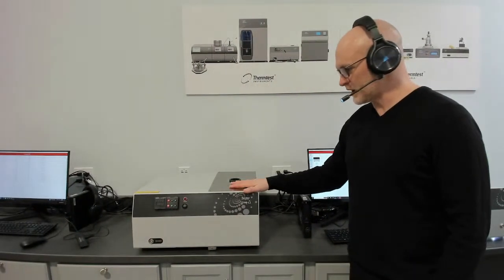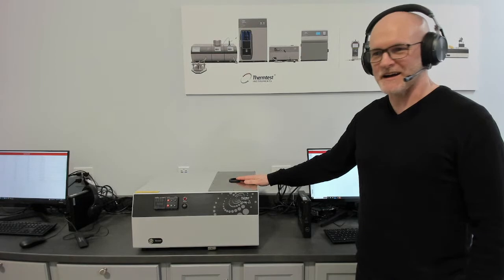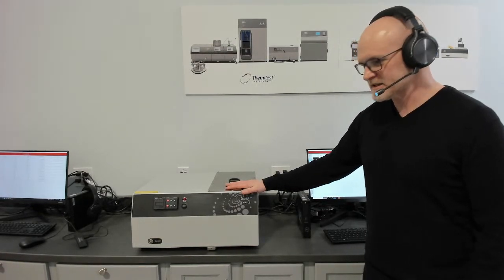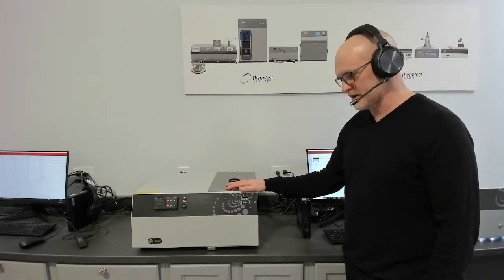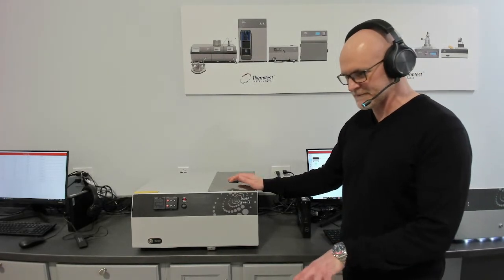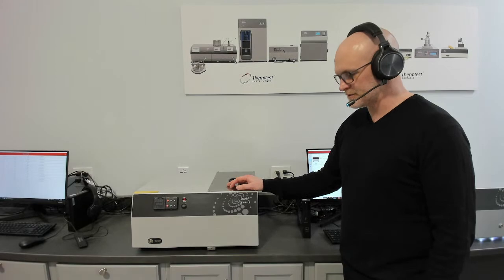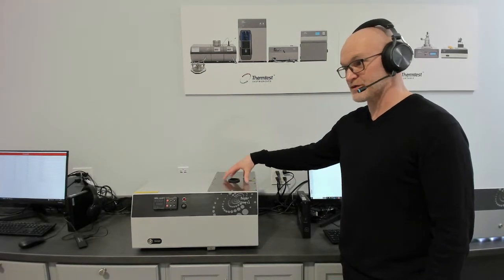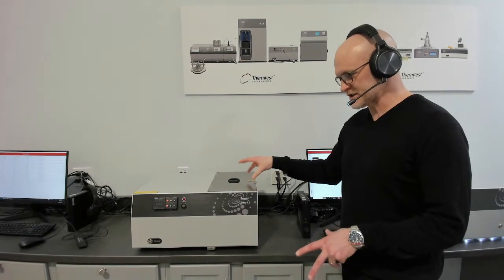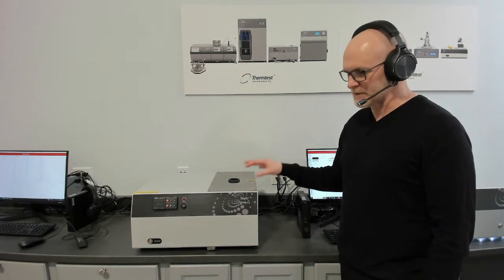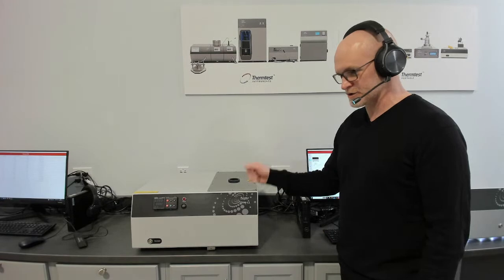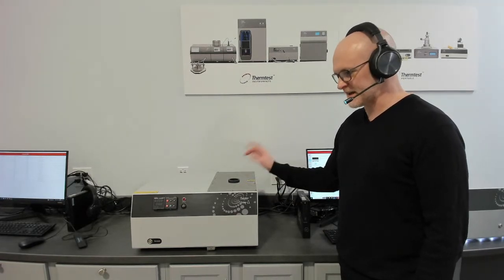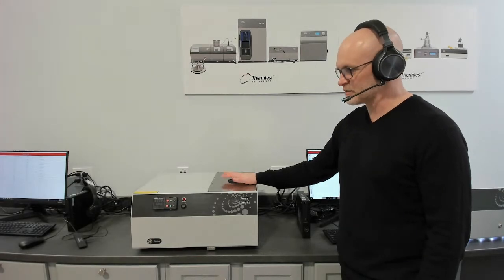This is our transient hot wire. It's missing its sensor. The sensor would be in here. This is integrated temperature control. This is for measuring liquids and phase change materials from subambient. It can be configured to minus to cryogenic temperatures minus 160 up to 300 Celsius depending on your configuration. It is a primary method designed for liquids to control convection. That's its principal strength. You can back pressure it to test past boiling points.